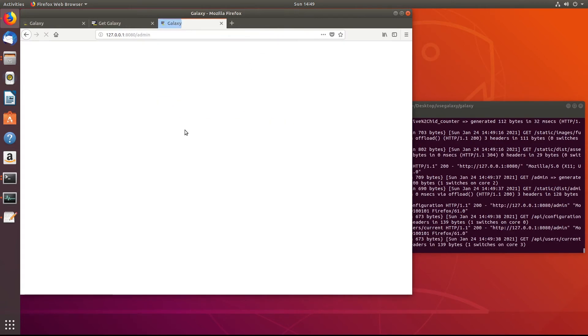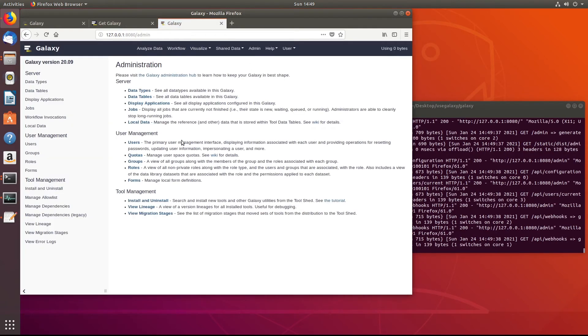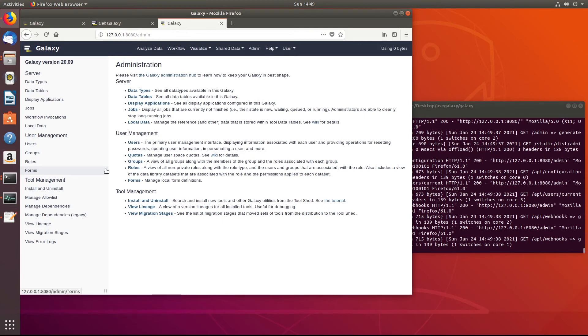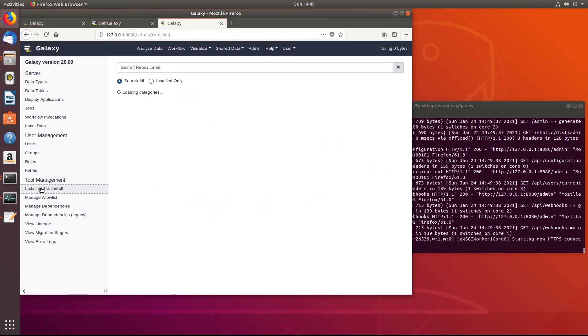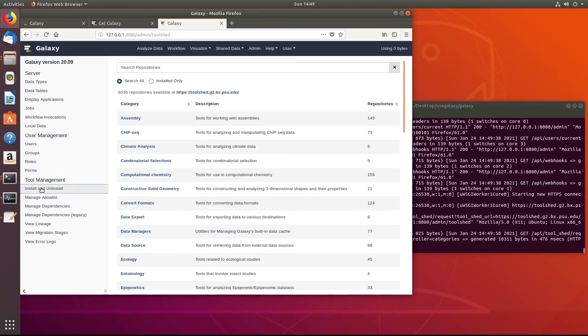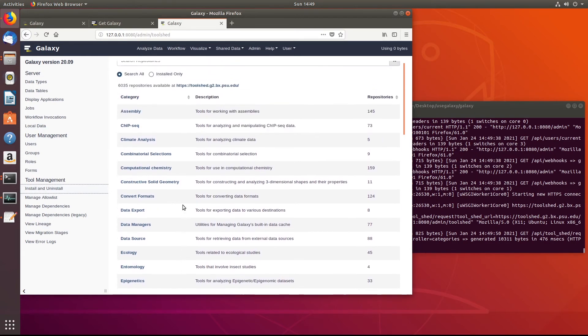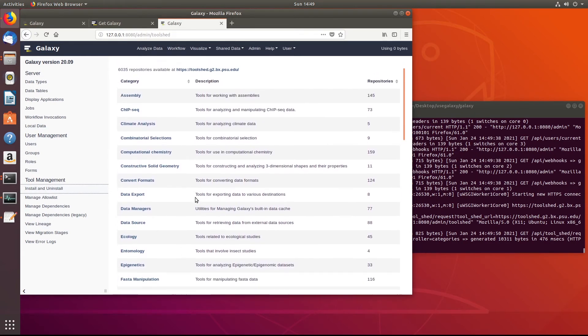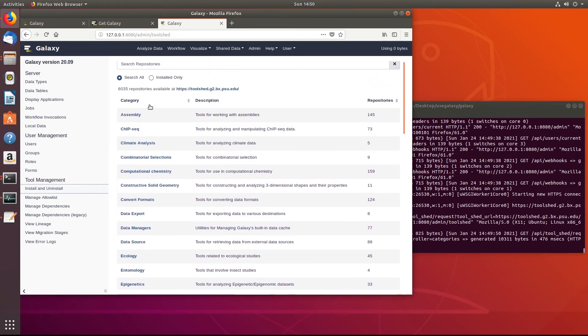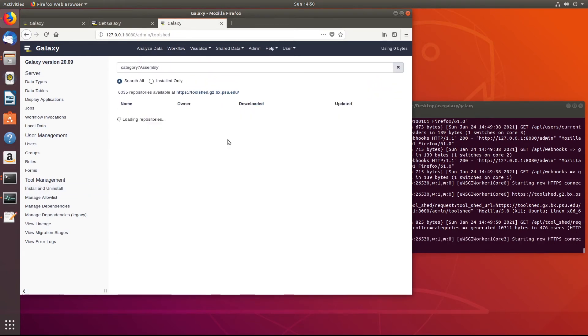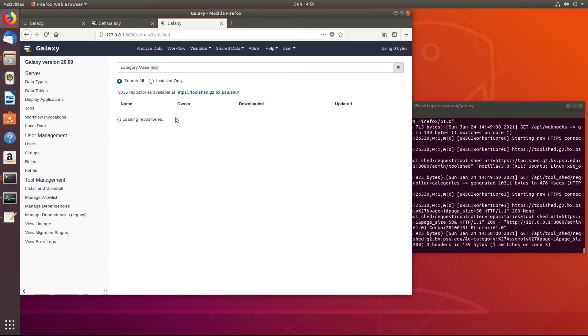But now since we signed up with that same username and password that we had used on the useGalaxy website and that we had set in the admin user line of the config file, we have this admin button here. If we click that admin button, that's going to allow us to change tons of different stuff on the server side. So generally what you're probably going to want is to install and uninstall tools. So go ahead and click that and then you have all the different categories. So if we want, I don't know, go to assembly, we'll be able to find some assembly tools.